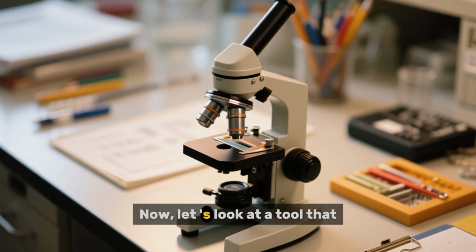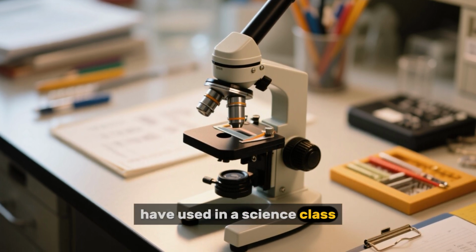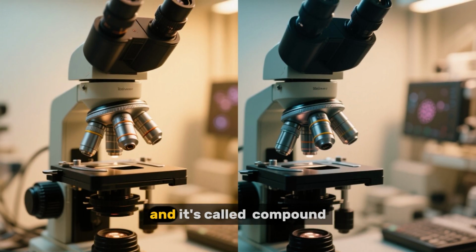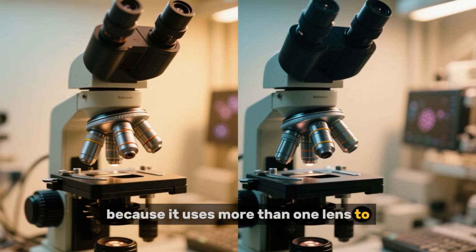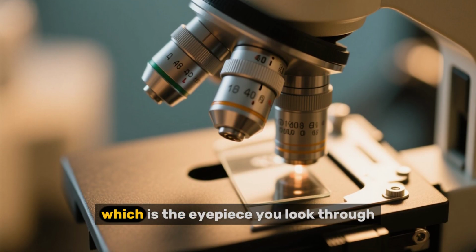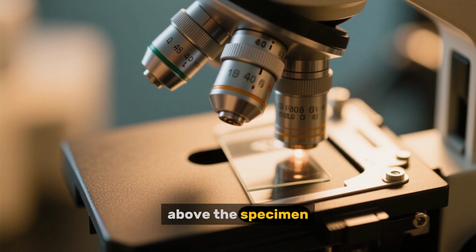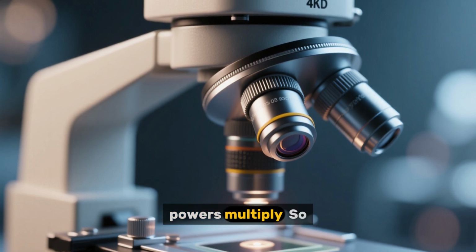Now, let us look at a tool that many of you might have used in a science class: the compound microscope. This is a classic light microscope, and it's called compound because it uses more than one lens to achieve its magnification. There's the ocular lens, which is the eyepiece you look through, and the objective lens, which is the one right above the specimen. The really cool part is that their powers multiply.